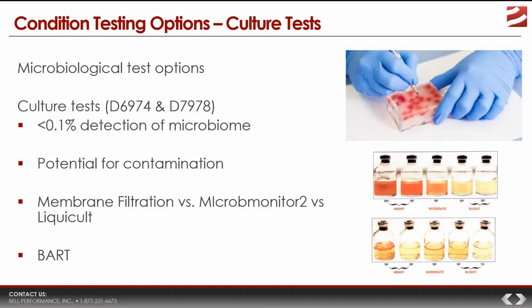And what that enables you to do is be a little bit more specific on exactly what kind of microbes are growing in there, which could be useful if you're trying to figure out what to do. I mean, one of the bottles selects for sulfate-reducing bacteria, which can cause serious problems. Some of them select for denitrifying bacteria.